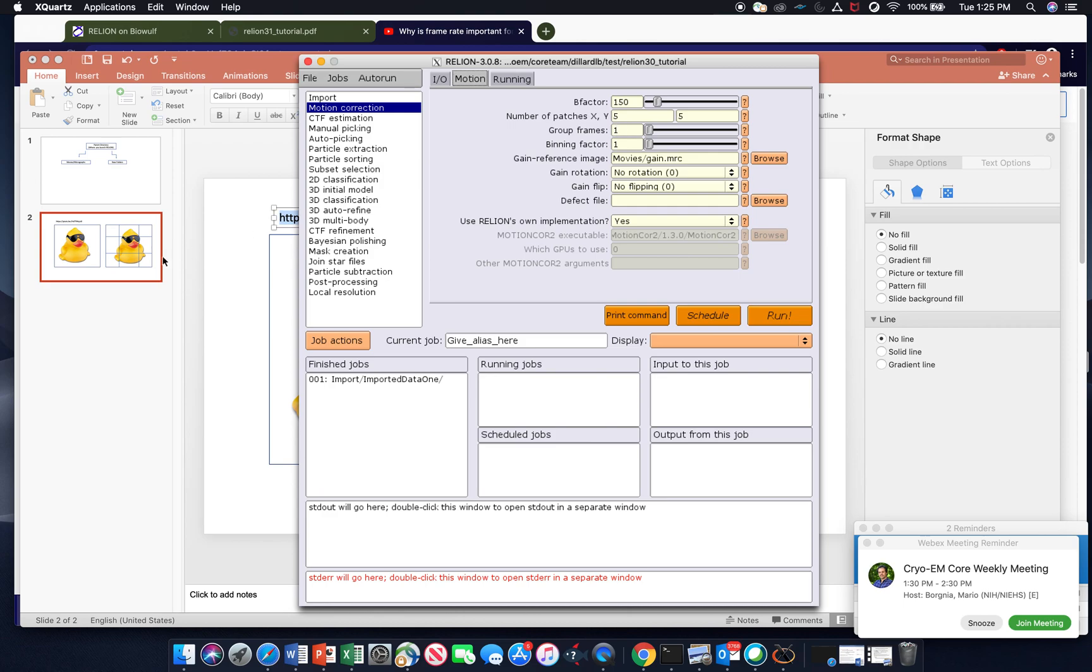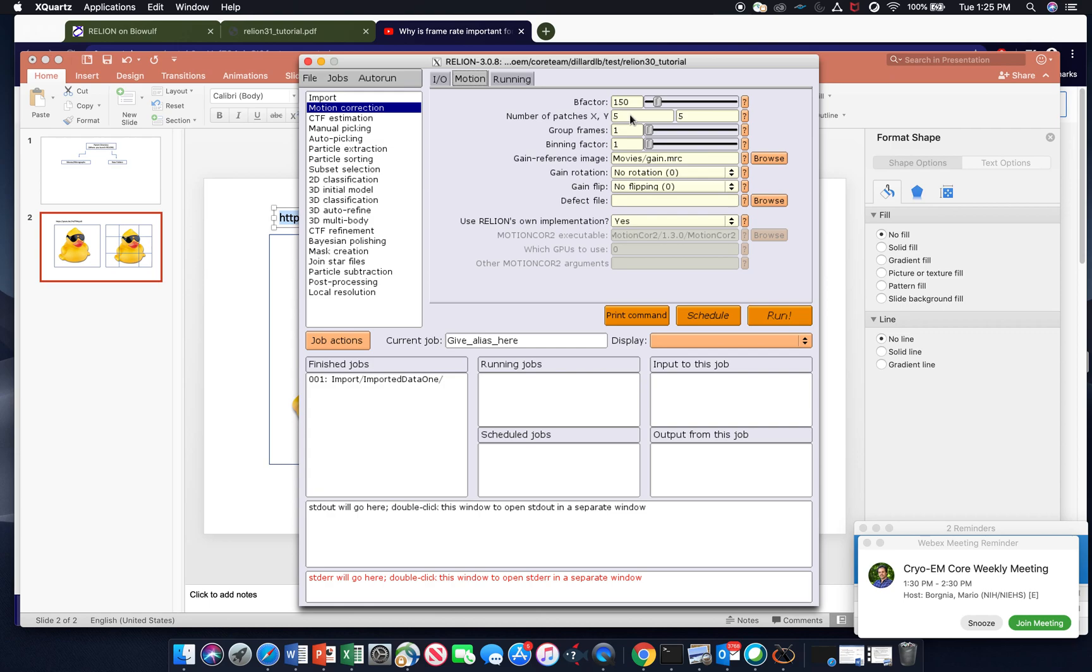Next, what I was mentioning in the duck image example, this is the number of patches or number of tiles you want to break your image into. The higher number of patches requires more computing power and slows down the speed in which you can process the data. But it also increases the resolution of your final result. So five by five is a common number to use or common parameters.